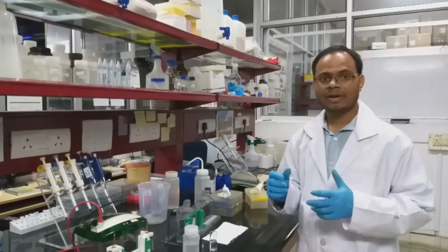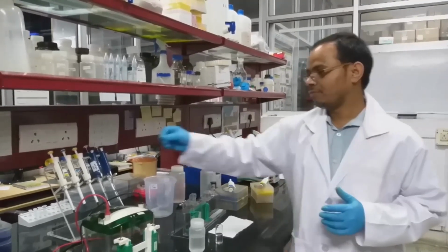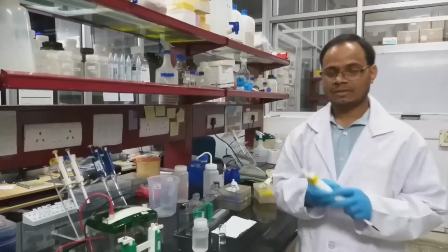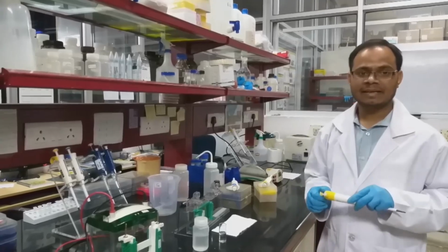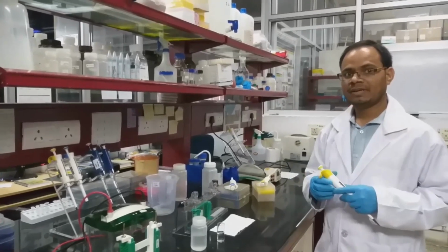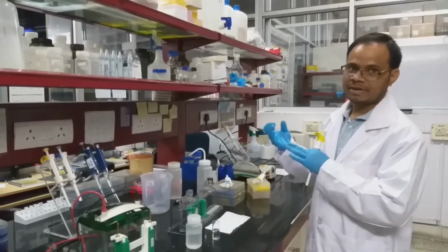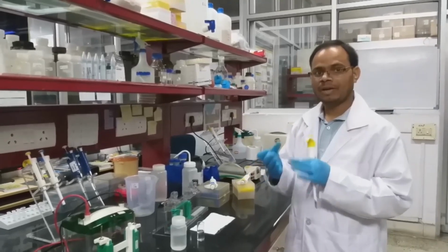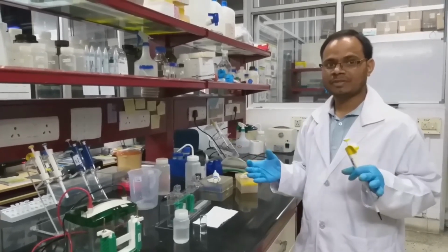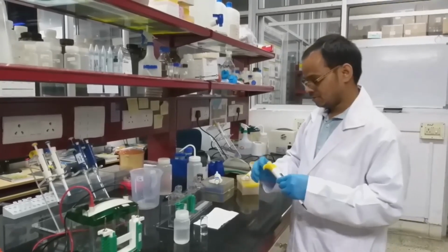So that's why you have to add it at the end of the resolving gel. So I'm going to add 5 microliter of this TEMED, which catalyzes the ammonium persulfate. Ammonium persulfate in turn provides free radical species, and free radical species accelerate the polymerization. This is the overall principle of this resolving gel. So I will add TEMED.